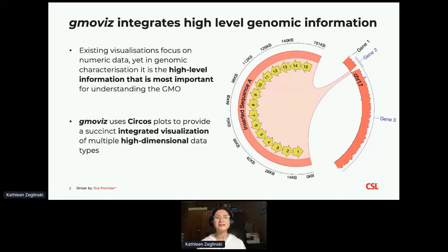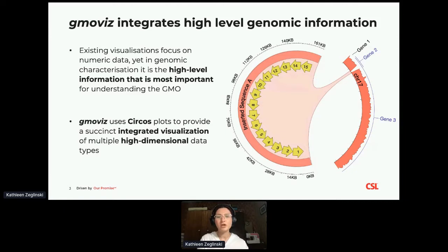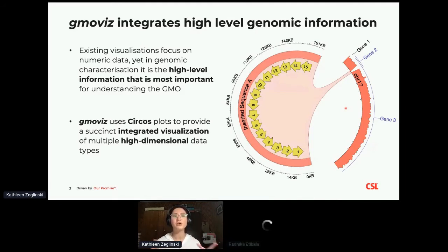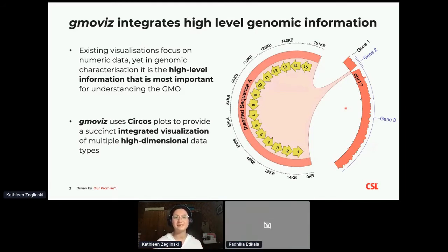To deal with this problem, we've developed GmoViz to quickly and easily describe this information using Circos plots. On the right hand side here, you can see an example of a plot produced by GmoViz, and I'd like to quickly talk you through what you see here and what it all means.